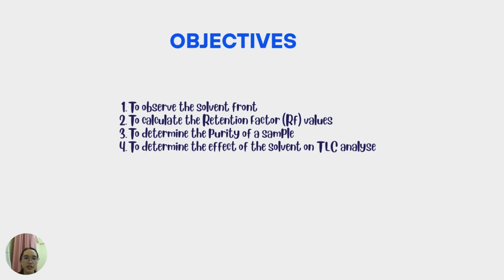Next, for the objectives: first is to observe the solvent front. Second, to calculate the retention factor, RF values, to determine the purity of a sample, and lastly, to determine the effect of the solvent on TLC analysis.